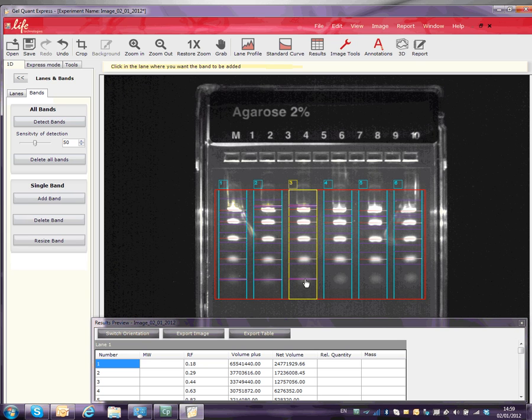You can remove erroneous bands by clicking the Delete Band button and then clicking on any unwanted bands.